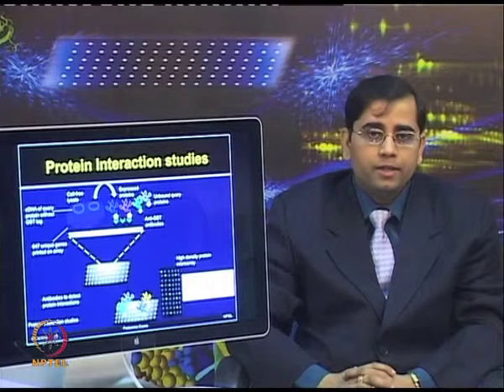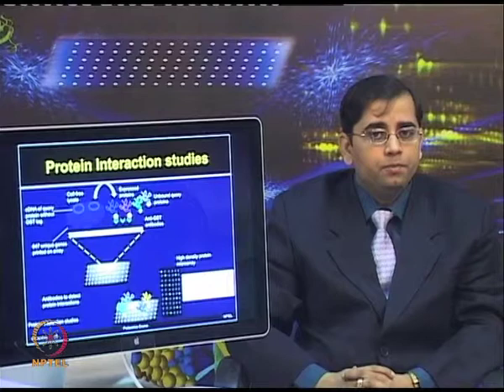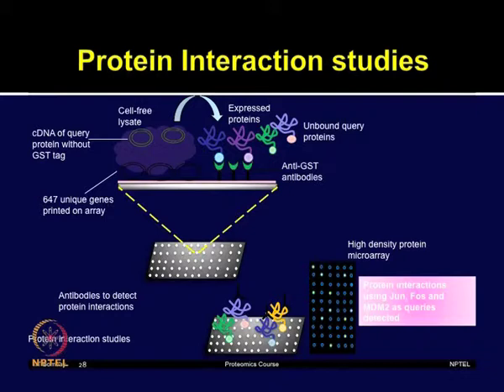So, Ramachandran et al. used a high density NAPA approach to study the binary interactions between several well characterized interacting pairs such as Jun-Fos, P53 and MDM2. Now, selective binding to these interactions was identified by using specific antibodies.